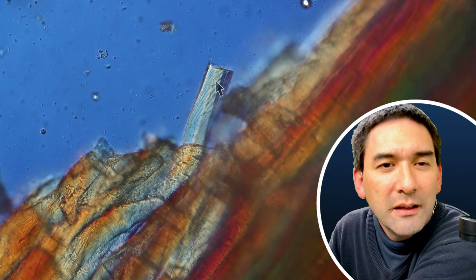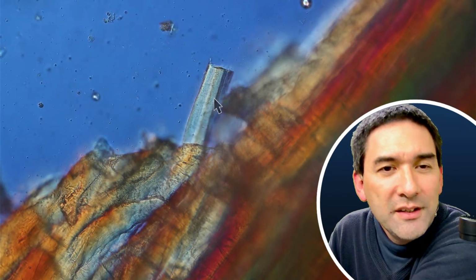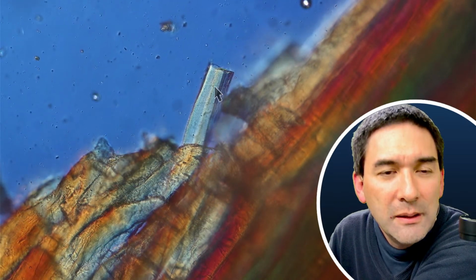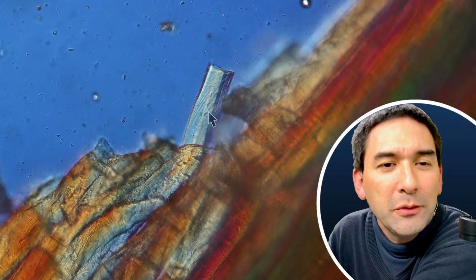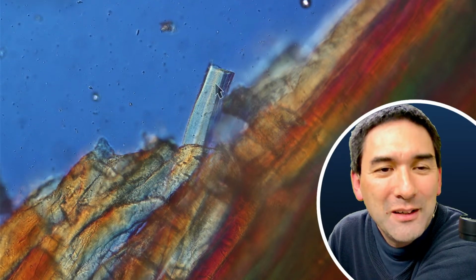Okay. Yeah, it looks like there are tiny little stripes next to each other. These are the so-called light and dark bands of so-called striated muscle, skeletal muscle. Yeah, and that is very typical for skeletal muscles. And if you're able to see these striations, then you've got a pretty good microscope, because they're pretty small.